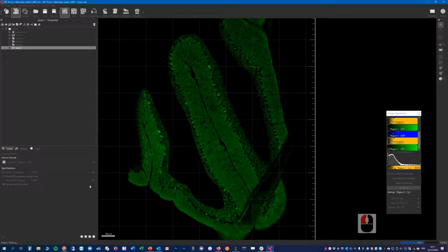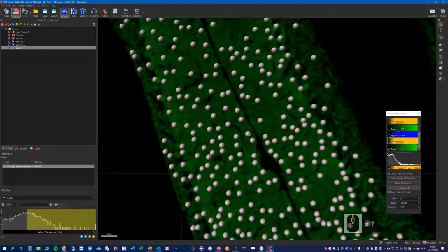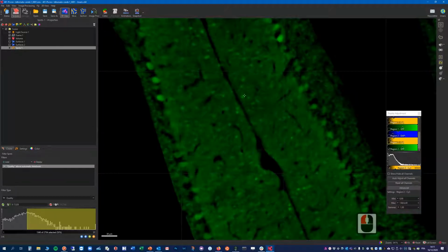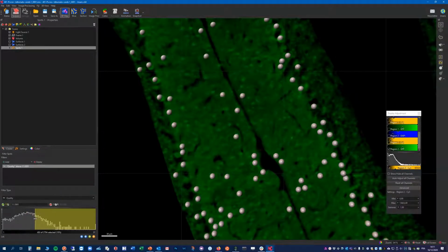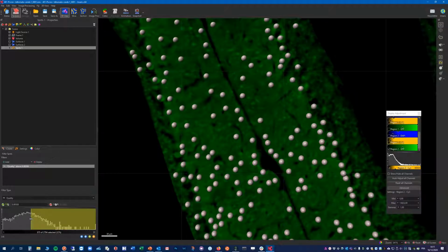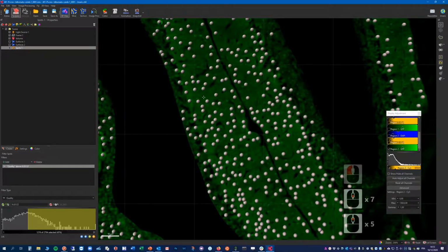Next step here. So here we will have to make sure we get all the points we want. At this step we can filter them, but what we really want is to make sure all of the necessary spots are there. So I want spots, for instance, on those small structures here, and make sure we have them. So let me just enable spots again. Here it's the case, and if we play with the quality threshold, you can see we will quickly lose some of them. So I re-enable them progressively until almost all of them are covered. So here I'm sure I'm not missing any of them.